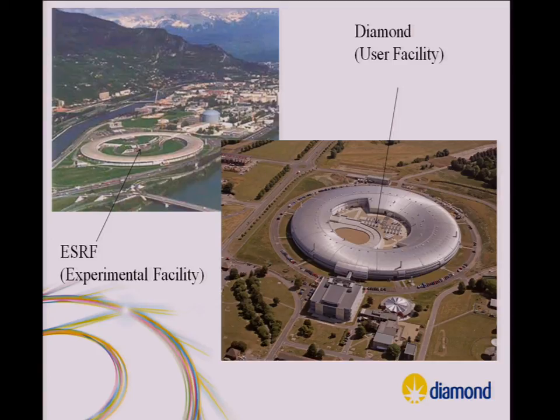There's two more questions at the back. About GEF, you're using GEF for drawing diagrams. Yes, for drawing diagrams, and I saw soon you're going to use Graphiti. We are, yeah, for the workflow stuff I showed you with the rectangles and the lines between. I showed that briefly at the end.